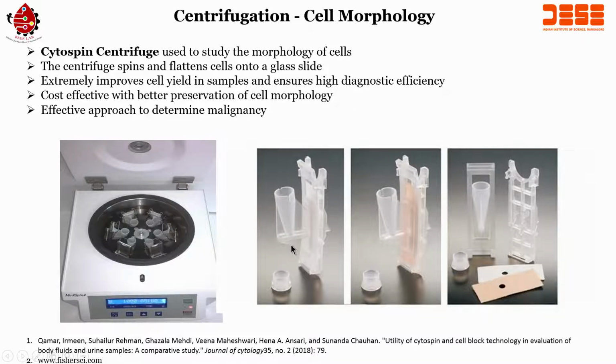So, at a very high speed the cells will be smeared on this glass slide, and the advantage of using this technique is that you can preserve the cell morphology and you can have a uniform distribution of the cells. Alright, there are these two advantages: you can preserve the cell morphology and you can have uniform distribution.